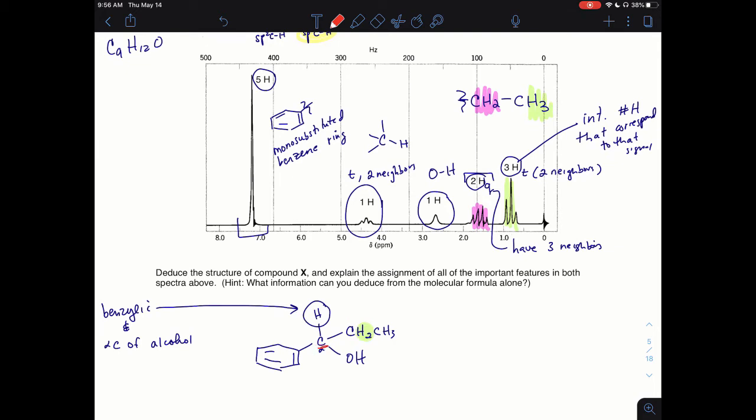Now, you have to look at the other adjacent carbon atom as well. There's no protons on there, so it won't split this signal at all. And then the OH doesn't usually split, but that is probably why this signal is so broad, because it's next to the OH as well. But we do expect a triplet for this because it has 2 chemically equivalent neighbors. So expect a triplet, and that's what we see. Good, so far so good, right? So the ppms are consistent with our expectations, and then also we expected a triplet.